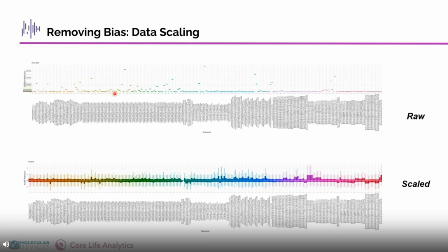One thing you can do is to relate every data point to the standard deviation of the distribution for that measurement. This generates what is known as the Z-score. Now you can see how the scales are much more similar. A better way to do this is to use what's known as the robust Z-score. This is less sensitive to extreme outliers.